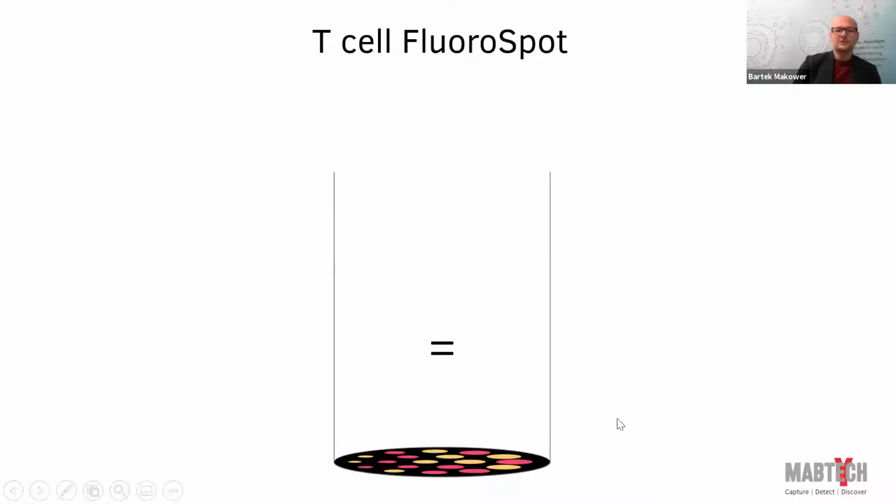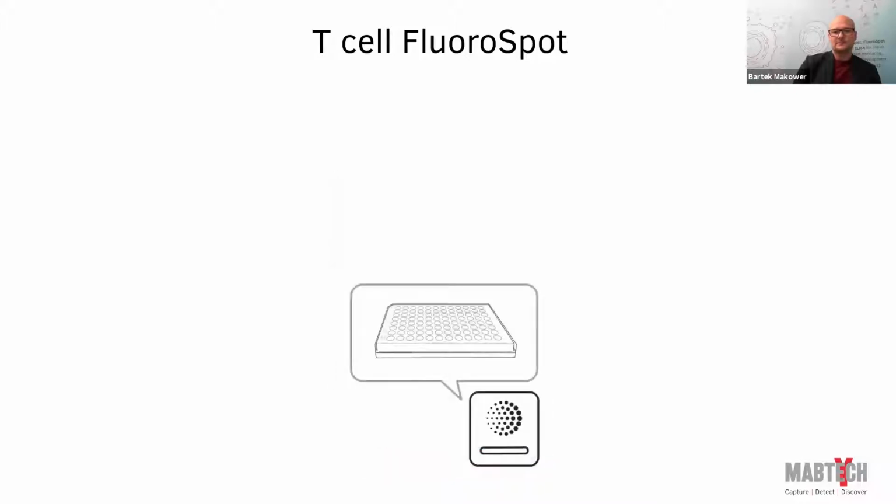So the software is very good at identifying exactly the spot center and really accurately measures which cells secrete 2 cytokines simultaneously. So you need a reader and software for this as well, of course, for analysis. And using 4 colors, then you generate quite a lot of data.